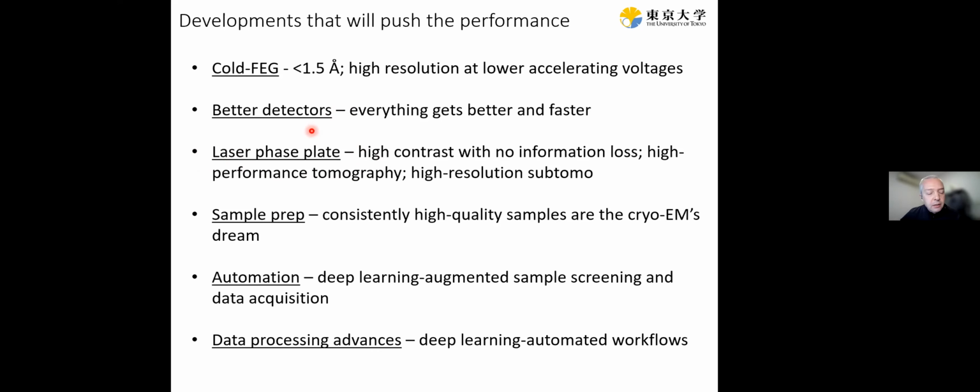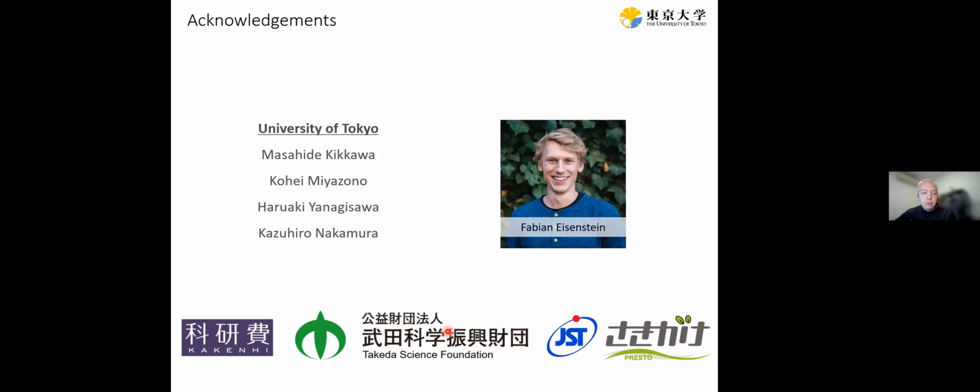I know I have run out of time. This is my last slide. So yeah, sample prep, very important, especially for the real biology, real pharmacology as well. All these structures that I showed were achieved primarily because of the efforts in Patrick's group and early on by Lynn and her followers on optimizing the samples. Screen your samples carefully, do negative stain. That's an ancient technique, but it's very helpful. Automation is very important nowadays. And of course, advances in data processing, which also drove the cryo-EM revolution.